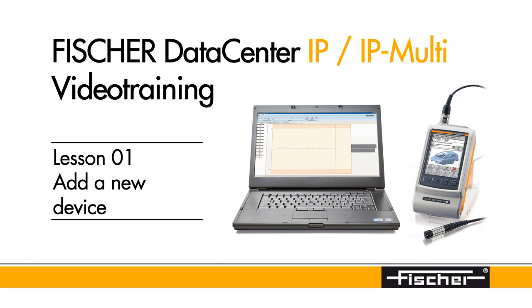To set up a new device, power up your Fischer Coding Thickness Measuring Instrument and connect it to your computer. Then open the Fischer Data Center software.